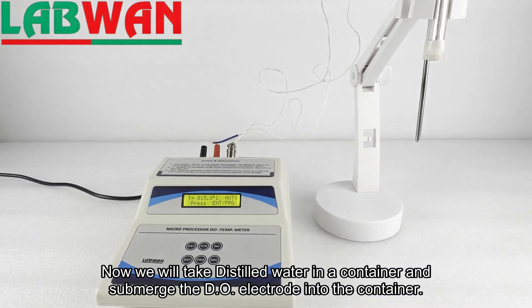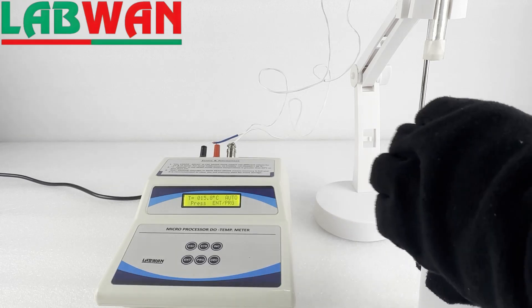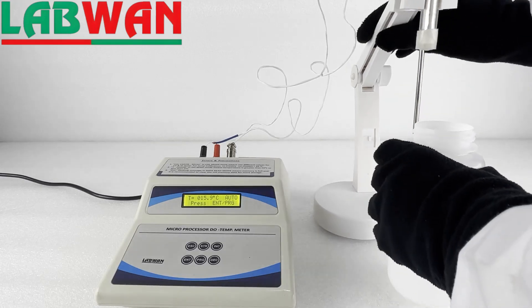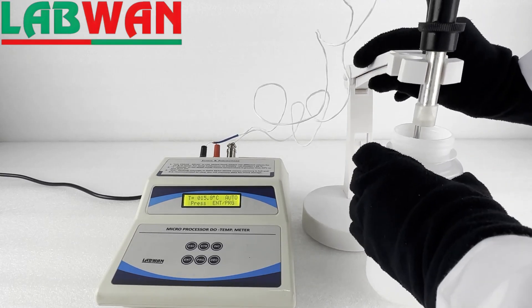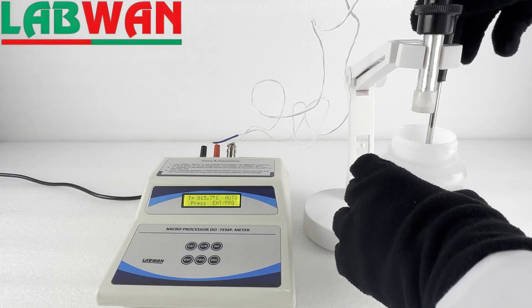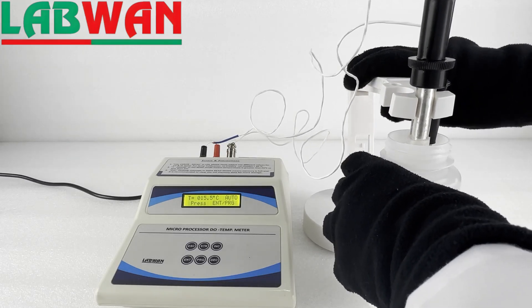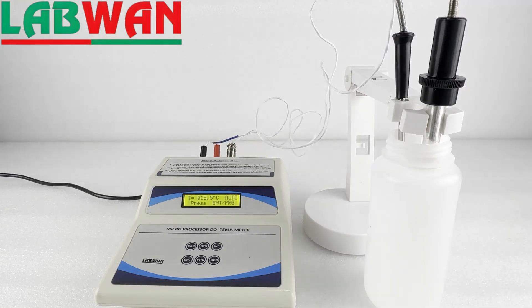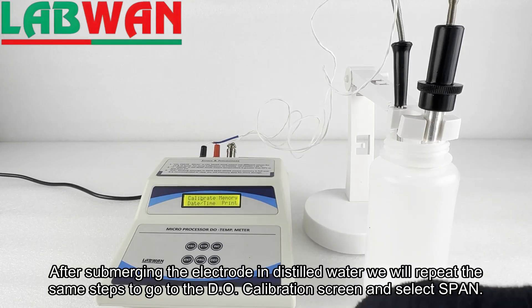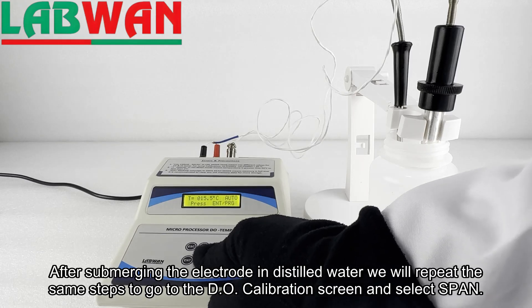Now we will take distilled water in a container and submerge the DO electrode into the container. After submerging the electrode in distilled water we will repeat the same steps to go to the DO calibration screen and select span.